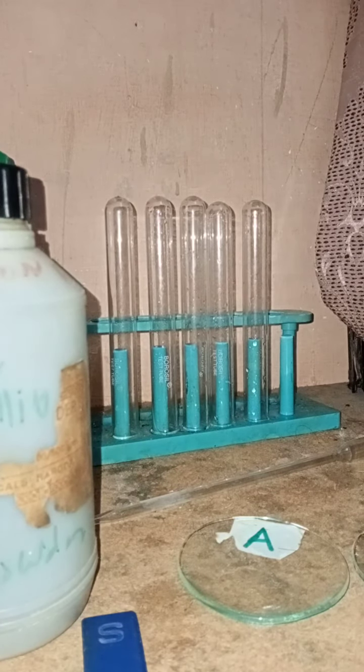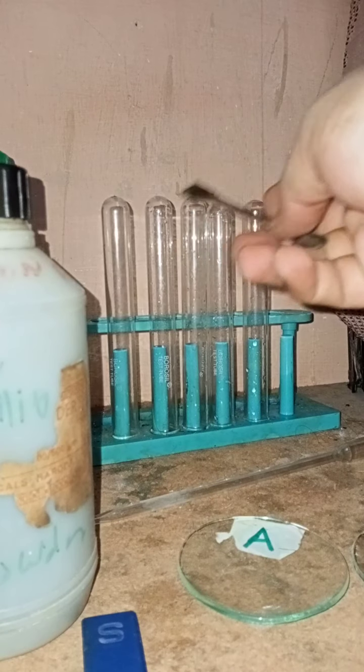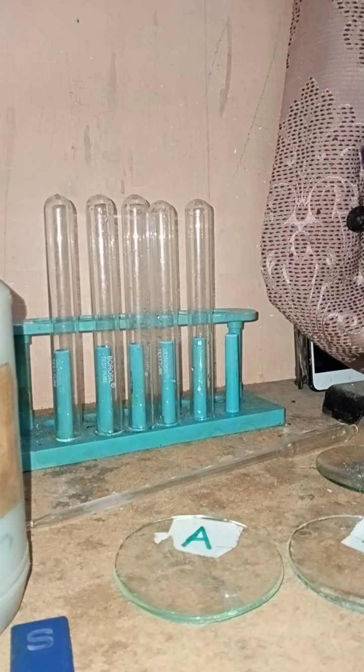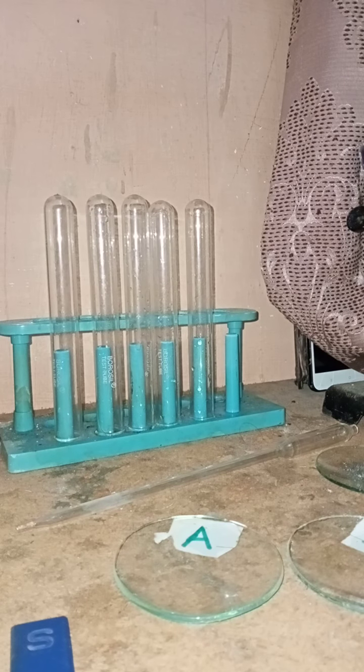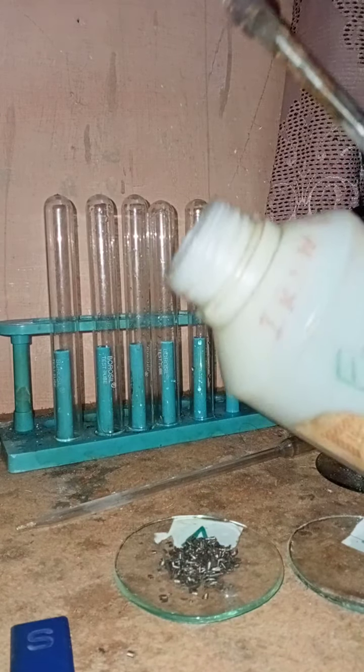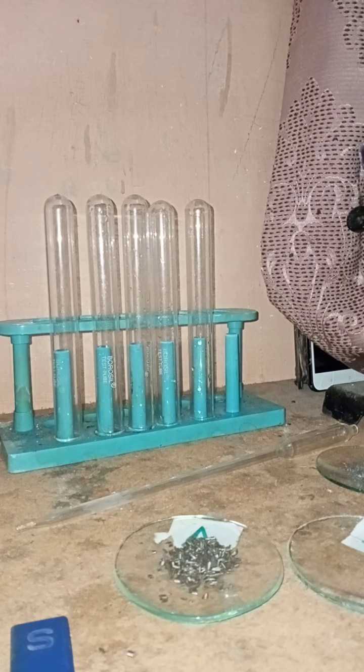We have a spatula, we have the test tube, we have the facility to filtrate or to perform the process of filtration. Now we are going to start some activity. So first we shall take some iron fillings into the watch glass. You can see the iron fillings are in watch glass A.